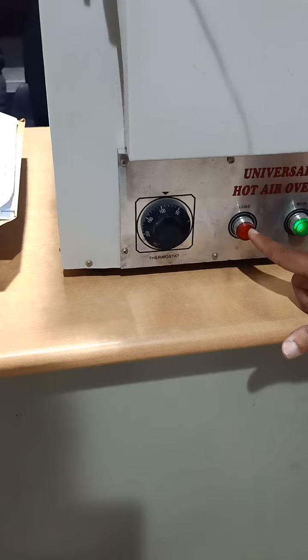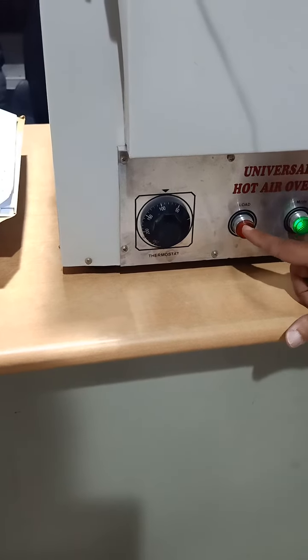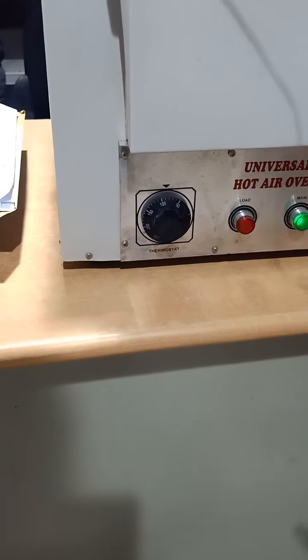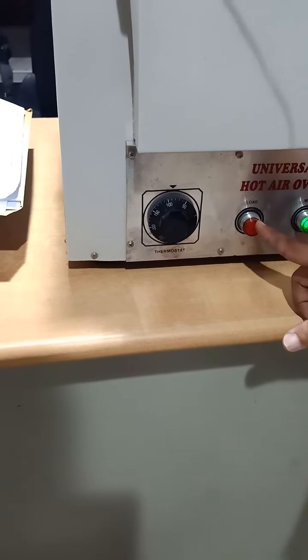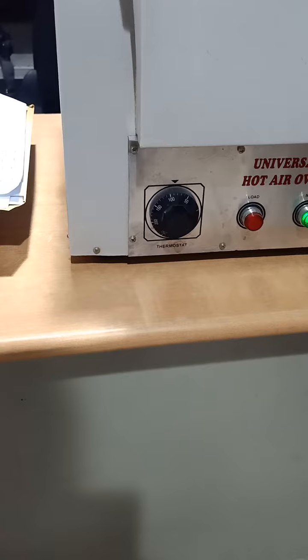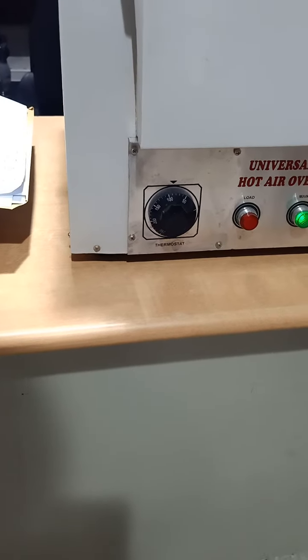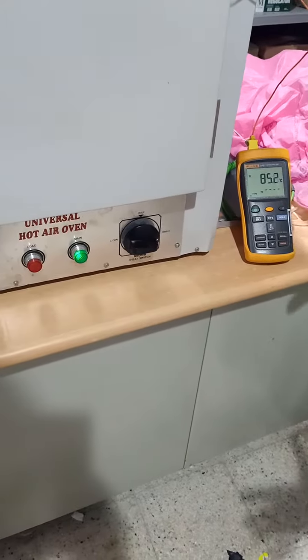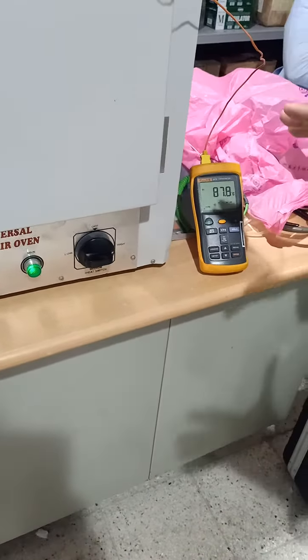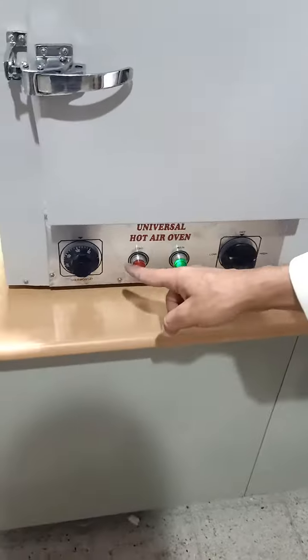Now we see that the heater is off because the temperature here is 66, which is more than the set point, so for that reason it is off. The temperature is now about 78, and it should stabilize like that. This means the instrument is working fine and it is heating correctly.